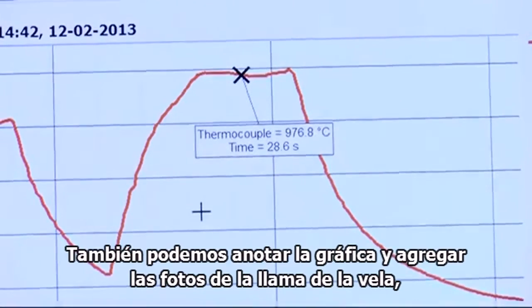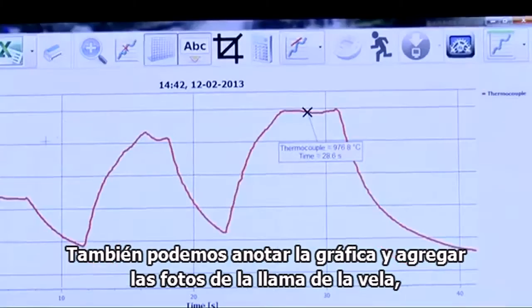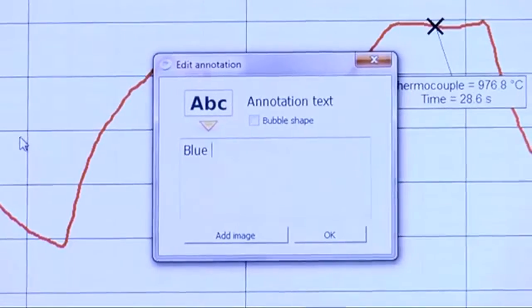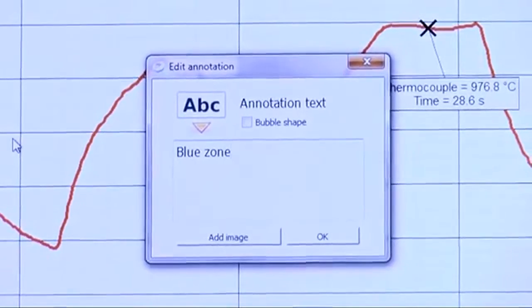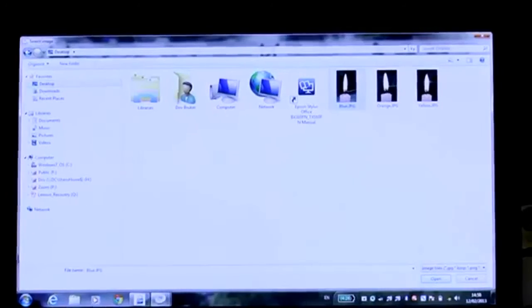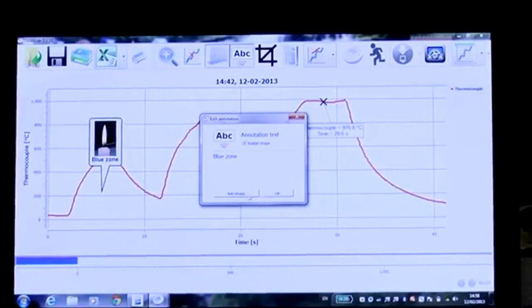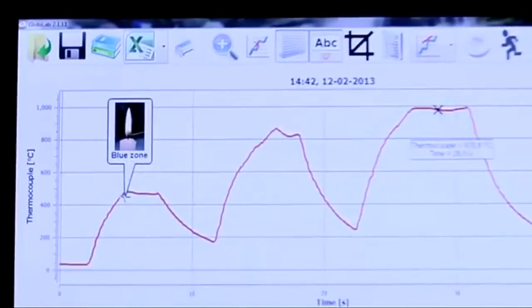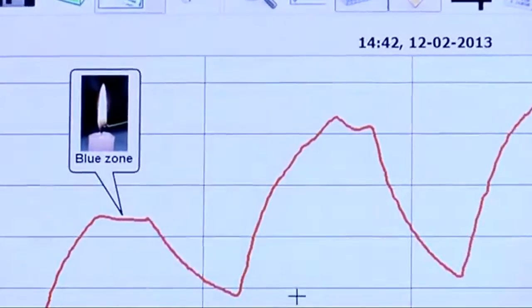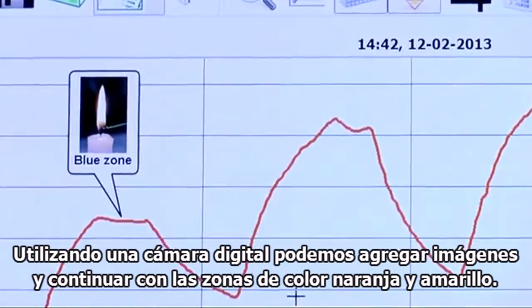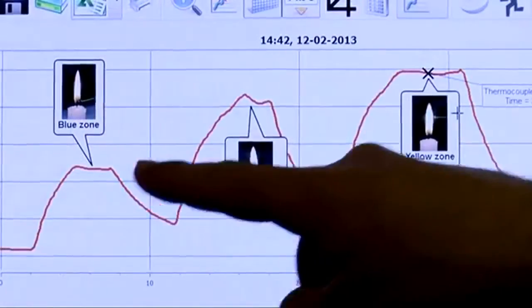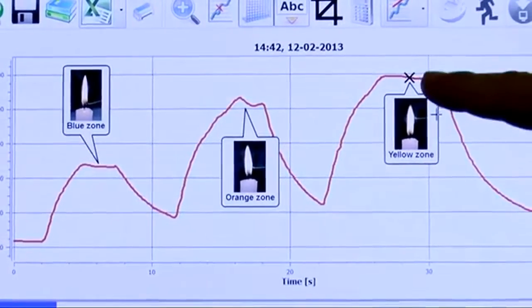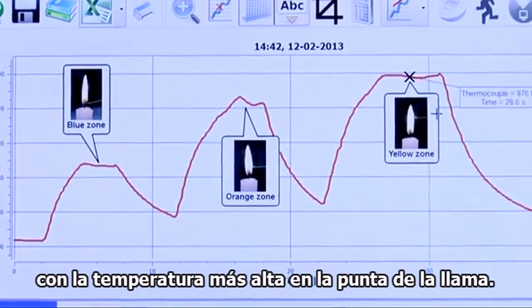We can also annotate the graph, adding pictures of the candle flame. We will start with the blue zone, and continue with the orange and yellow zones. Here, we can clearly see that the temperature rises as we go up the flame, with the highest temperature at the tip of the flame.